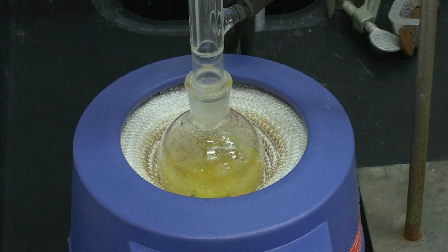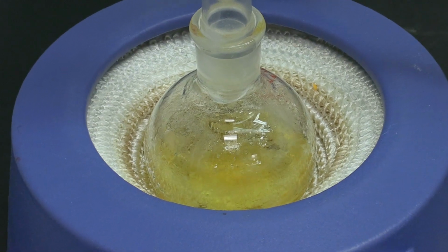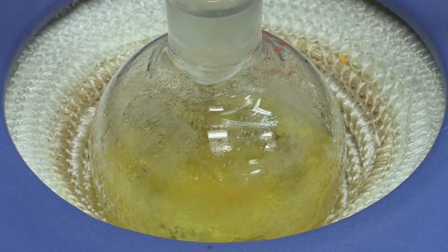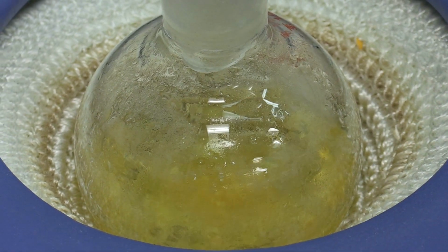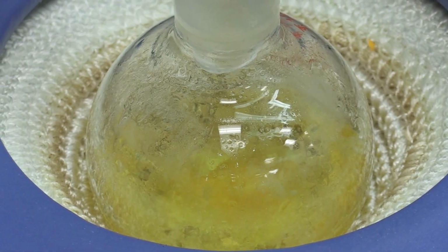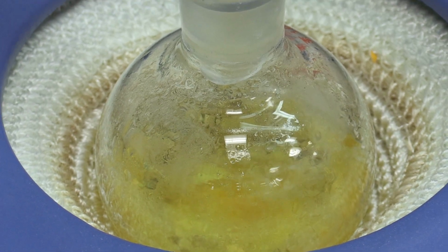Okay, the reflux process has started. We see that the liquid is running down the sides of the flask. Once that happens, we know that the vapors went up into the condenser. They condensed and started dripping down. So now we started our 90-minute time from this point on and let the reaction take place.